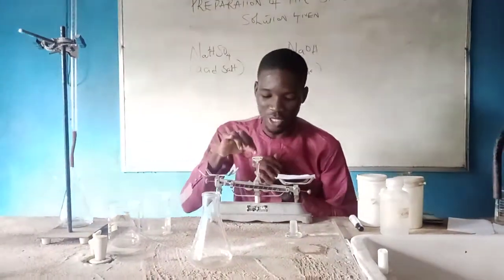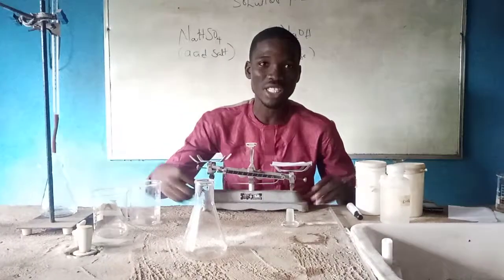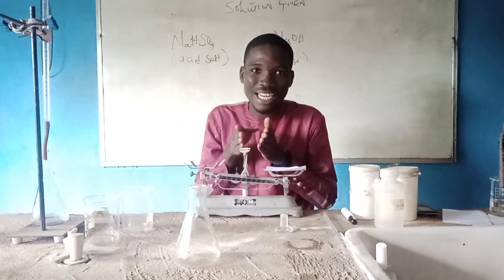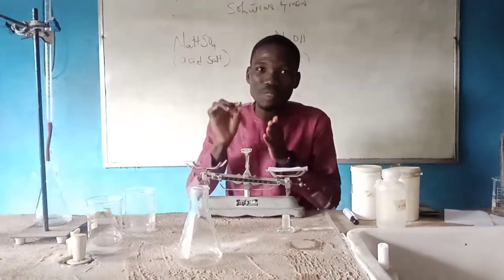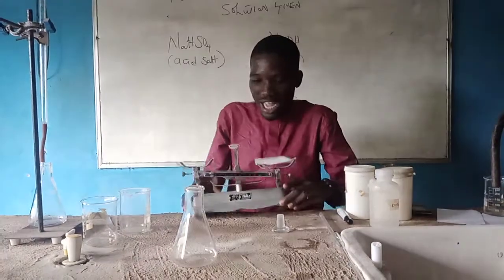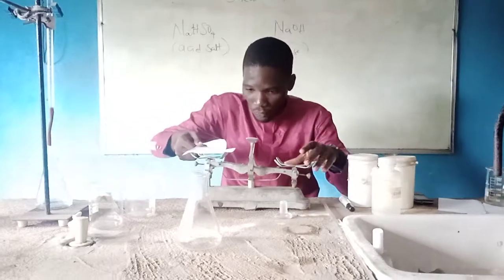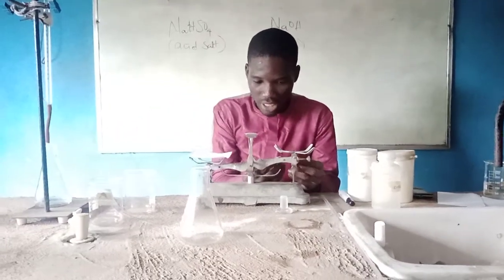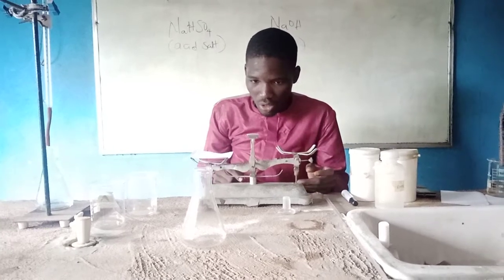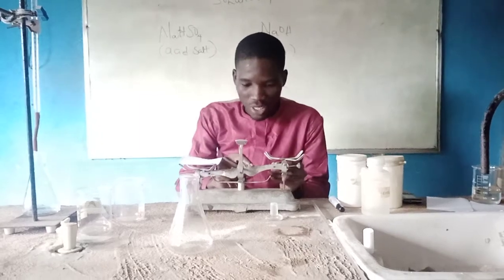So if you want to know which particular ring you are seeing here, you have to move this to a particular point in which we are going to have an end point. That is an exact point that will show you that this particular value is meant for the filter paper. So mind you, I have to turn it back to me so I'm able to get a particular value for the filter paper. So I move this gradually. So it's moving. So now I have this now.